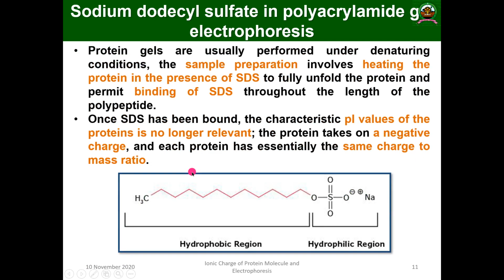Okay, then protein gels are usually run under denaturing conditions. So first, in the sample preparation, you prepare the protein sample, and you need to add SDS, and you need to heat the protein sample in the presence of SDS.